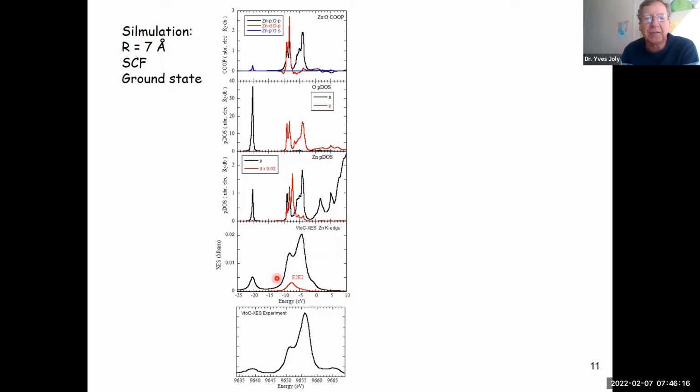And if you look at the spectra, you can see that here, where you have this bump, there are in fact also some S states of the neighboring atom. The calculation is done here at the zinc K edge in ZnO, I forgot to mention.